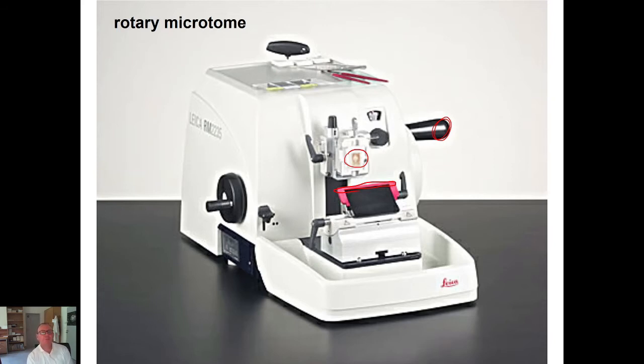Both these microtomes are used worldwide in laboratories. We have several sliding microtomes. Unfortunately, we haven't got a rotary microtome. We want it, but it's a little bit expensive this time, so we have only sliding microtomes.